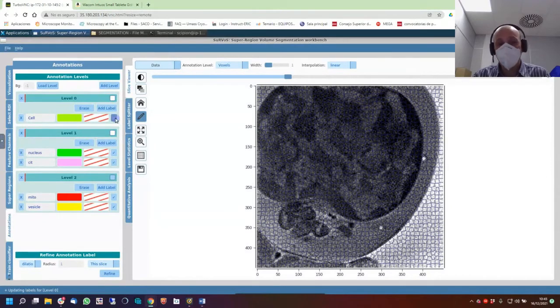In order to paint with this, we first need to click here to select it. Then we click on the pencil, and you will see some things appear. First, you can select the volume. Sometimes it's better to go for it, so we are going for the cell. Why not use total variation? It makes the cell even easier to see.